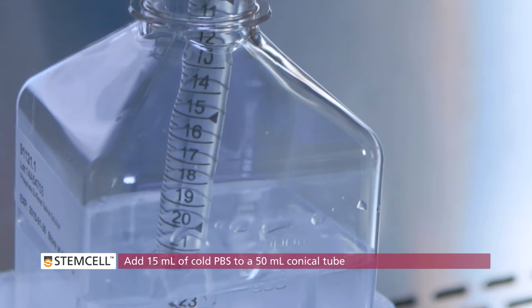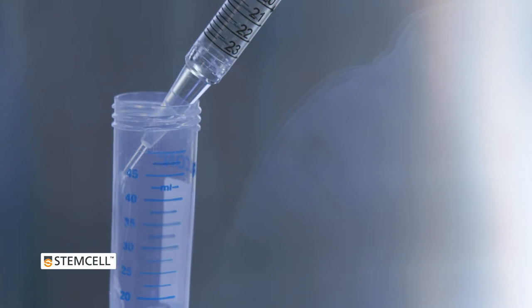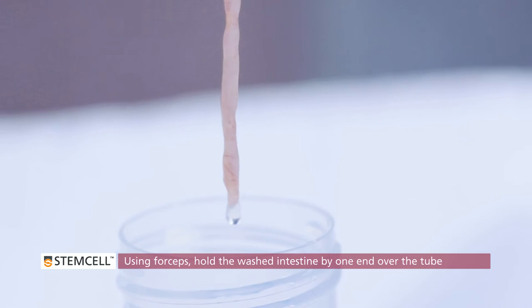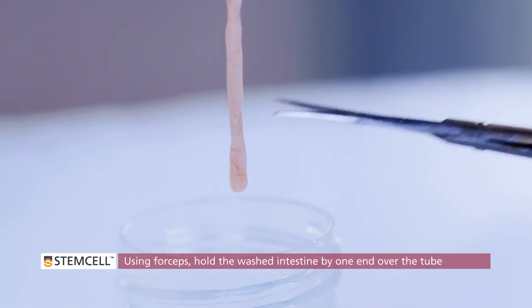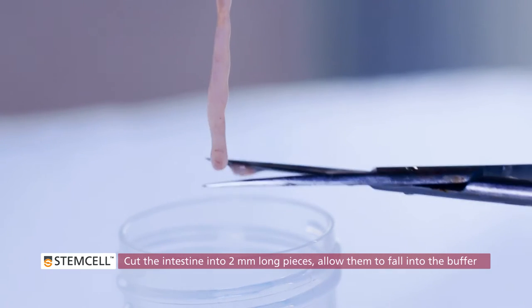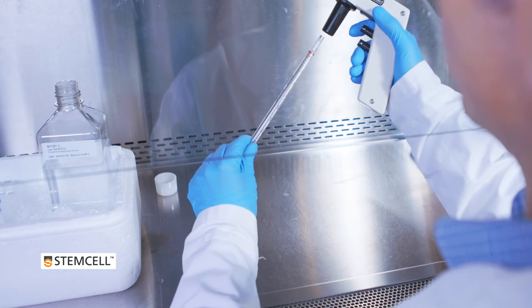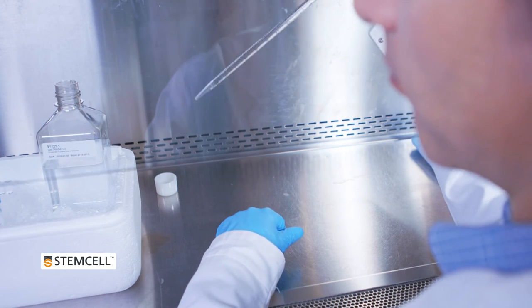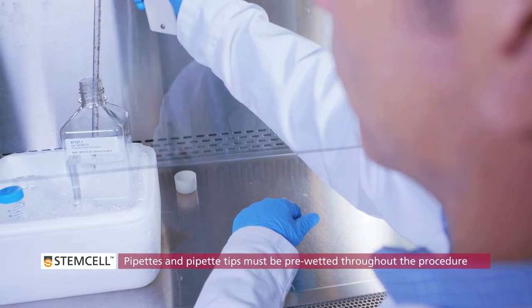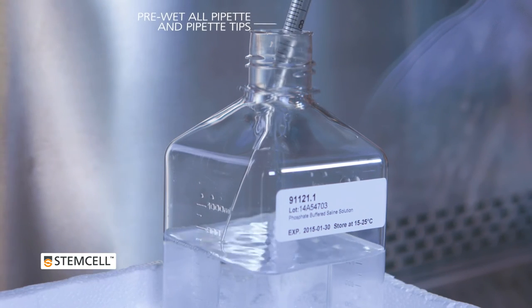Use the forceps to move the intestinal section through the clean buffer to rinse thoroughly. Add 15 mL of cold PBS to a 50 mL conical tube. Using forceps, hold the washed intestine by one end over the tube. Starting at the bottom, cut the intestine into 2 mm long pieces, allowing them to fall into the buffer. Wet a 10 mL serological pipette with PBS. Throughout the procedure, you will need to pre-wet pipettes and pipette tips before manipulating intestinal pieces or crypts to prevent the tissue from sticking to the wall of the pipette.